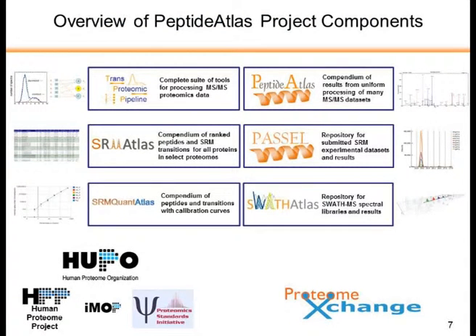And again, PeptideAtlas is MS/MS datasets, mostly ion trap, but other types as well, QTOF. Then there's SRM-Atlas, as Ulrika will talk about, as well as PASSEL. Closely related, SRM-Atlas is a database of SRM assays. SRM QuantAtlas is a database of SRM assays that have actually been run with calibration curves. So we have limits of detection and limits of quantitation, and we can make these plots.